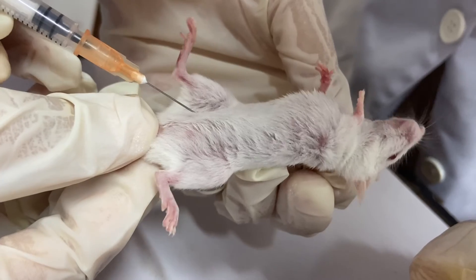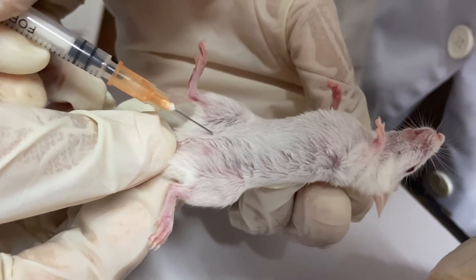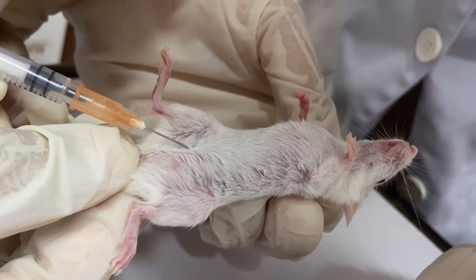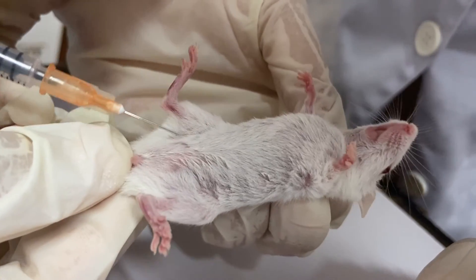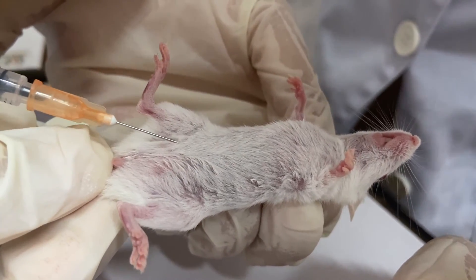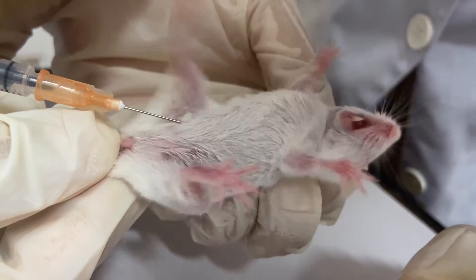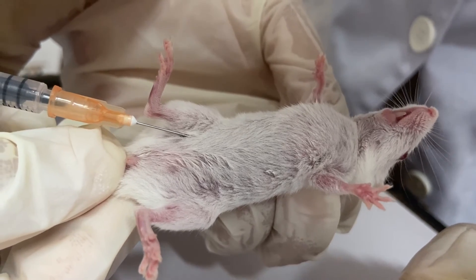Insert the needle at the right lower quadrant of the abdomen at a 30 to 45 degree angle towards the head. Aspirate to check if you are in the peritoneal cavity. If neither urine nor intestinal contents is withdrawn, proceed with the injection slowly.